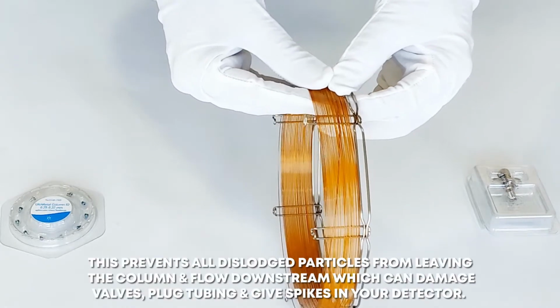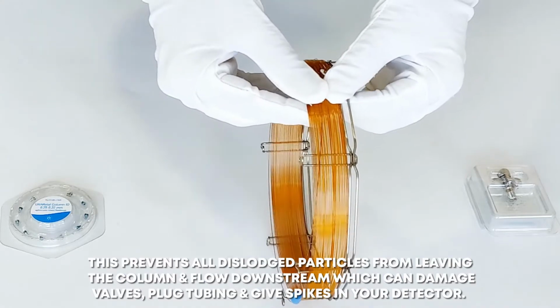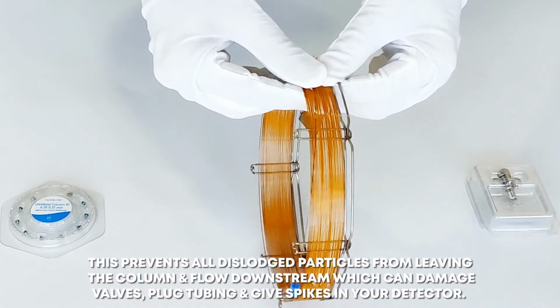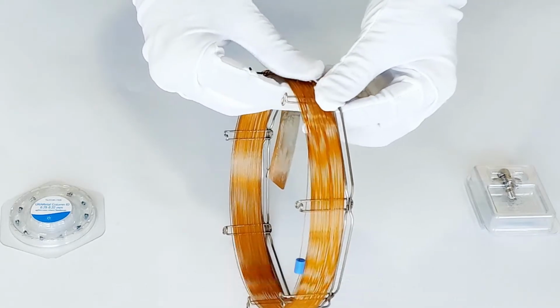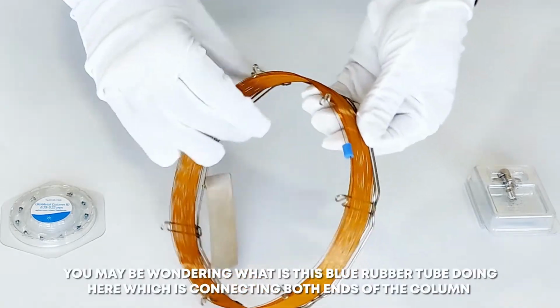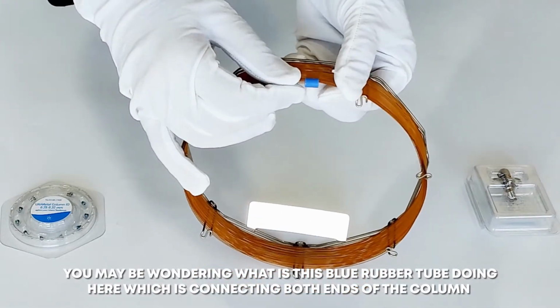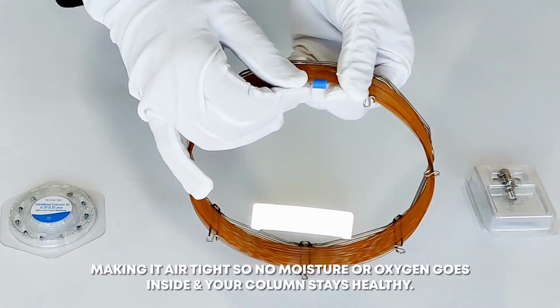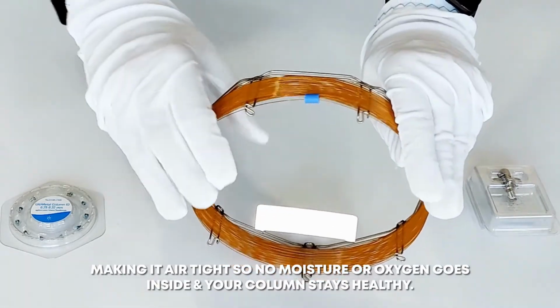This prevents all dislodged particles from leaving the column and flowing downstream, which may damage valves, plug tubing and give a spike in your detector. You may be wondering what this blue rubber tube is doing here, which is connecting both ends of the column, making it airtight so no moisture or oxygen goes inside and your column stays healthy.